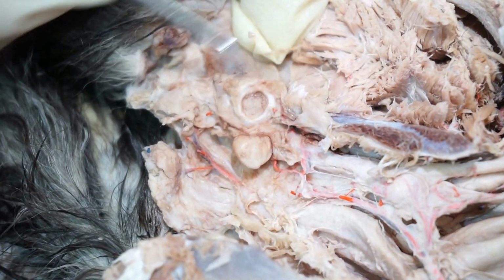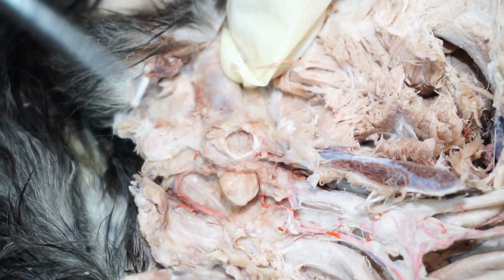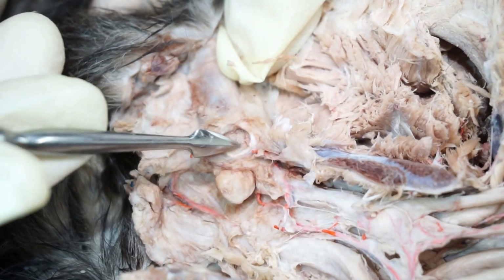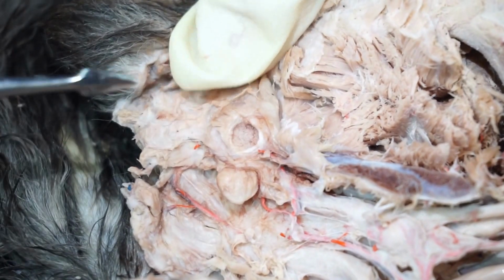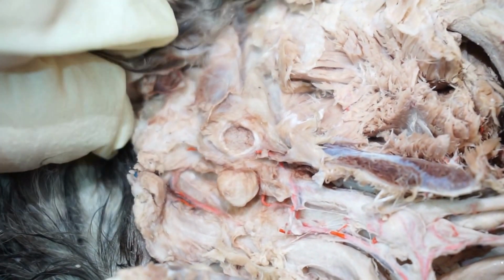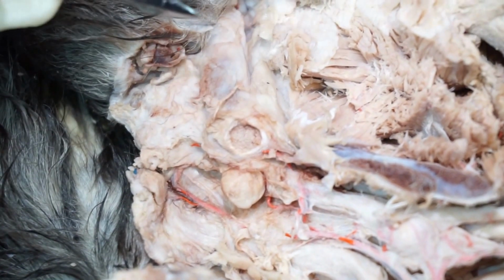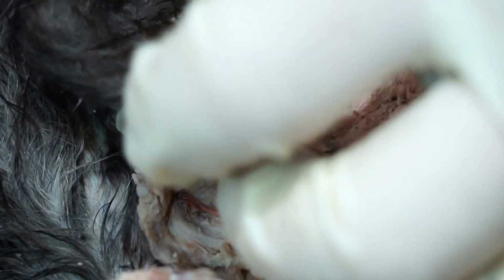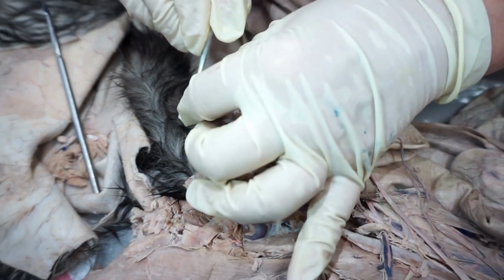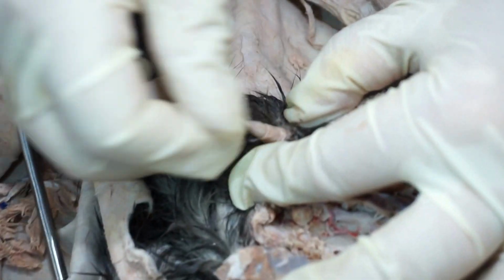I've taken the liberty to take a section here, and just like in the dog, we're going to have a crus in the cat. I will not expect you to know the muscles or all of any cross-sectional anatomy of a cat penis. I do, however, want you to be aware of this feature.